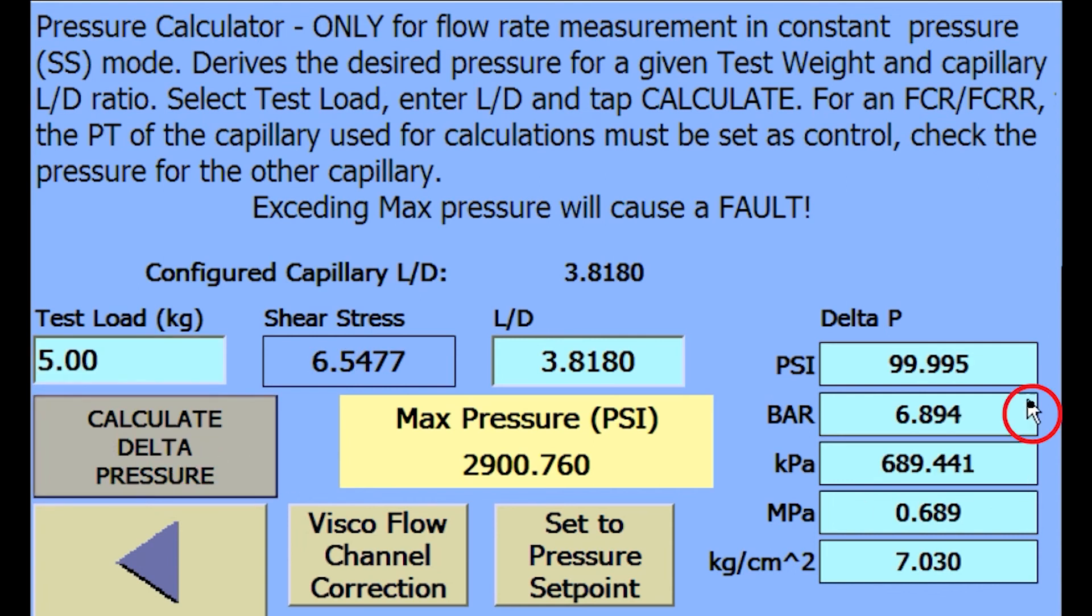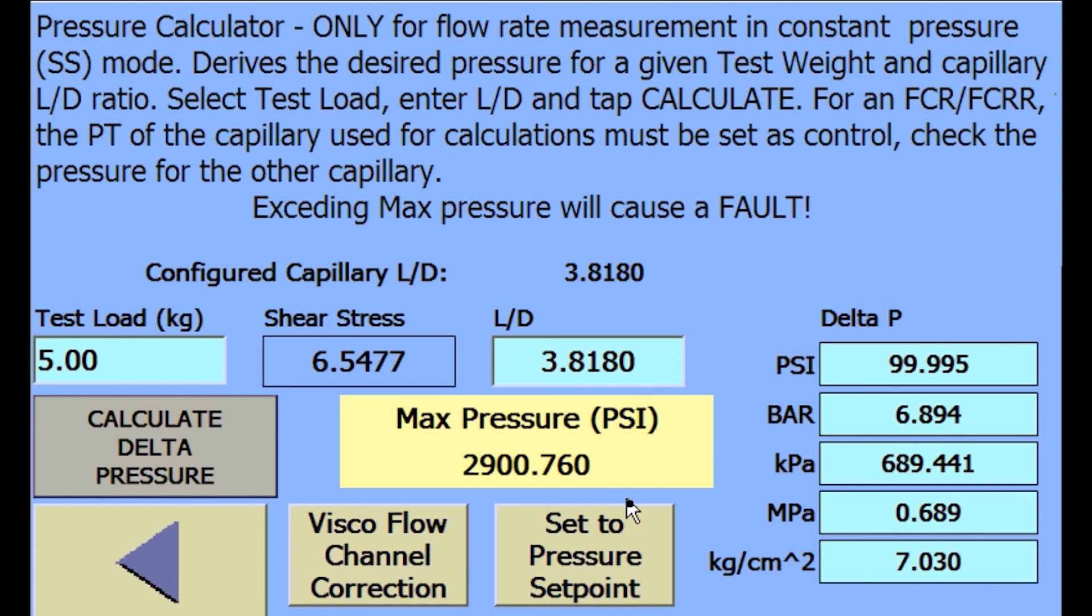Calculated pressure set points shown on the right are in all possible system units of pressure. Maximum pressure of the installed pressure sensors is shown in the middle of the screen. To directly transfer the pressure set points shown on this screen to the system's pressure set point, press the set to pressure set point button.